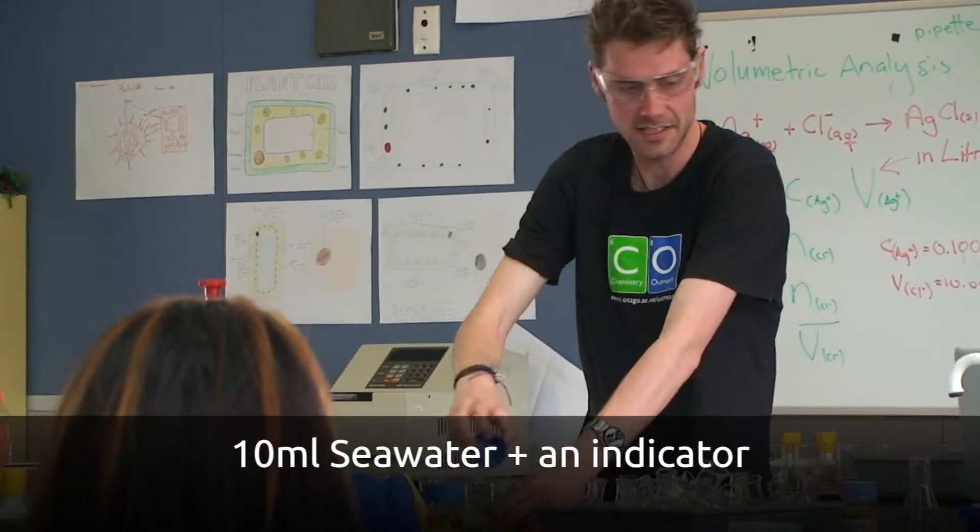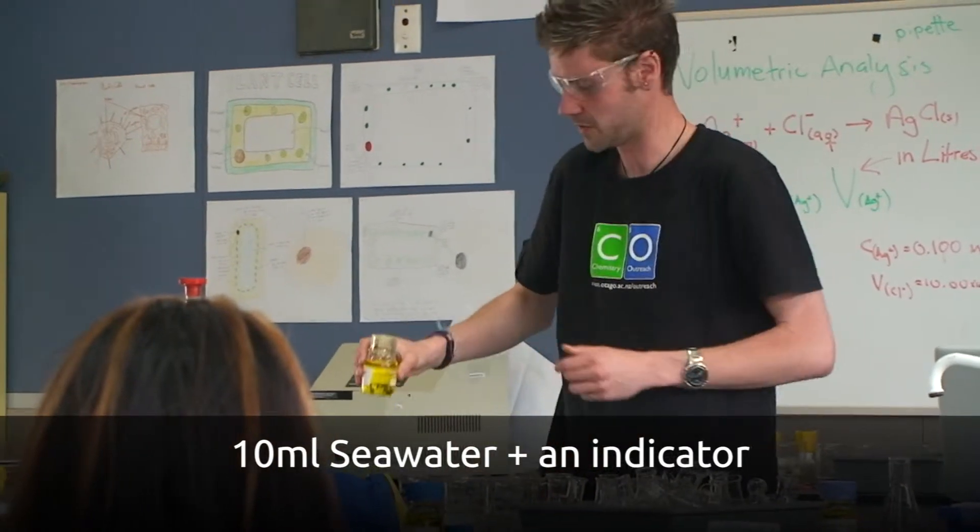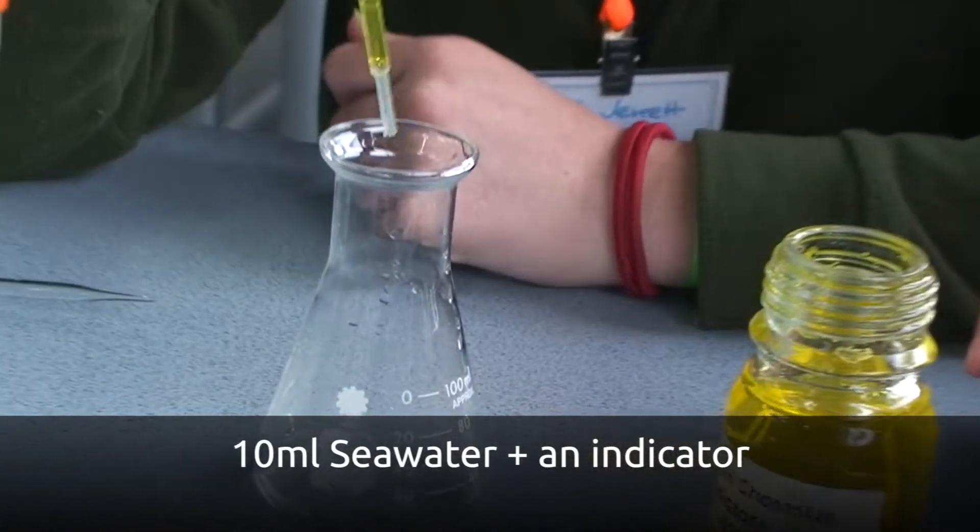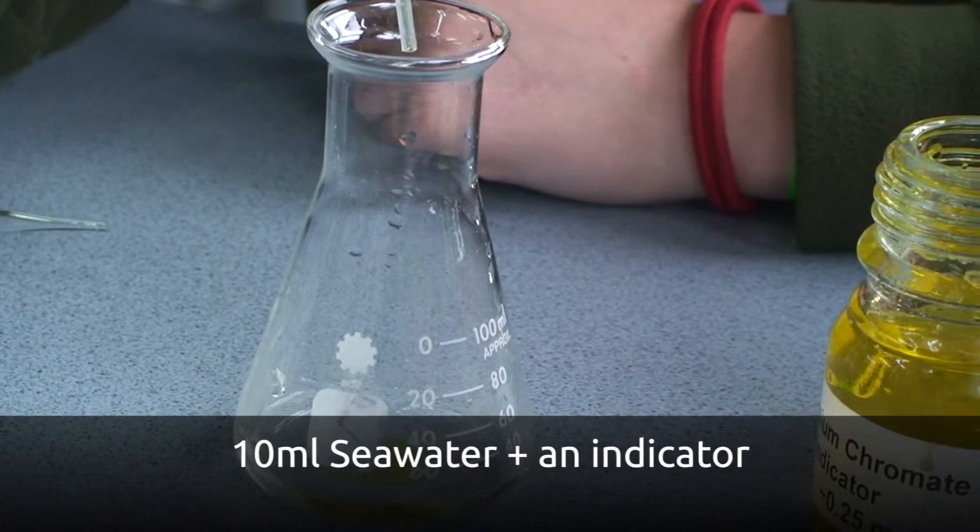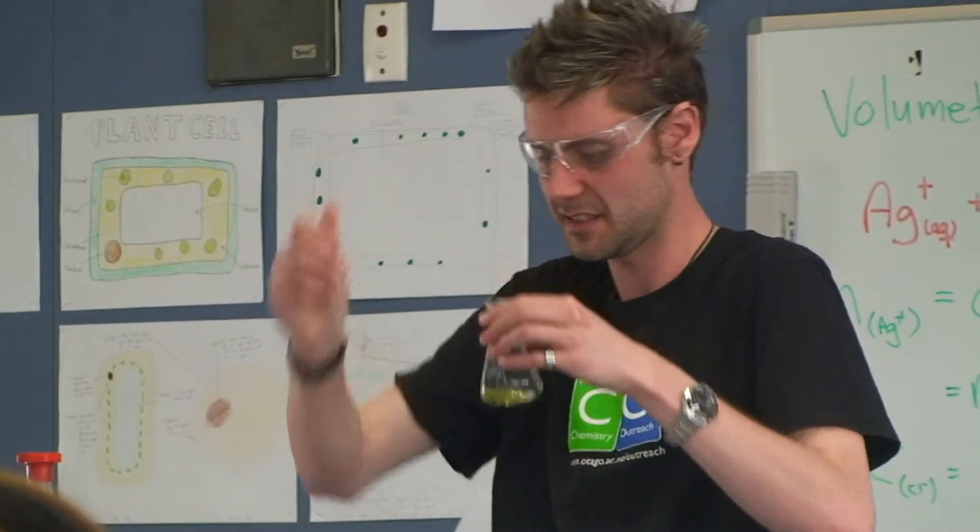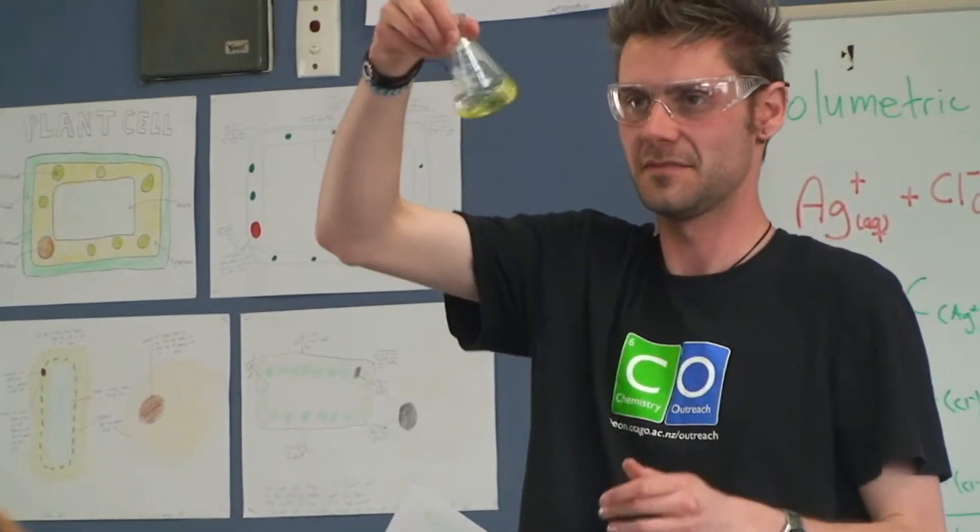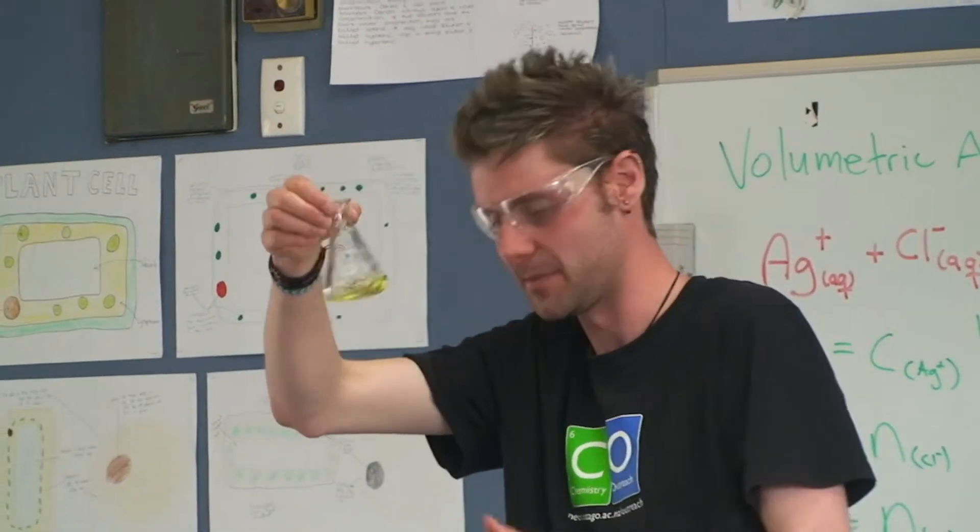And to see this, I'm going to need to add a couple of drops of this indicator. I don't want to add too much because it might start interfering with the reaction. So just 2-3 drops, that's plenty. You can see that it's gone yellow, that's the cream.